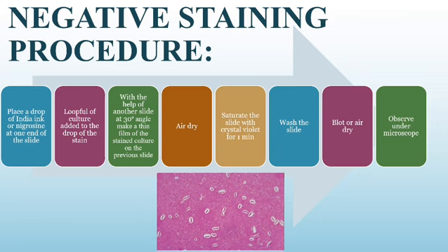What really happens is that the capsule appears colorless, the crystal violet added to the smear is taken up by the vegetative cells, and the India ink or nigrosin stains the background. Highly refractile, larger, colorless capsules are seen under the microscope, about twice the size of the vegetative cells, and it is a larger capsule being visualized by this technique.